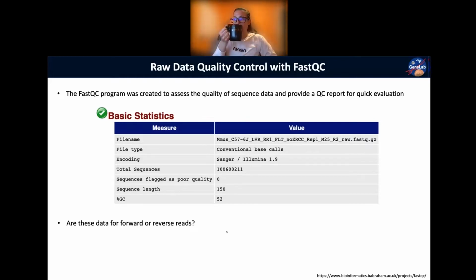Guesses, you can unmute your mic, put it in the chat. Reverse. How do you know that, Ty? Mark, you guess forward. From the R2, yeah. So in the file name, you'll see up here that there's an R2.